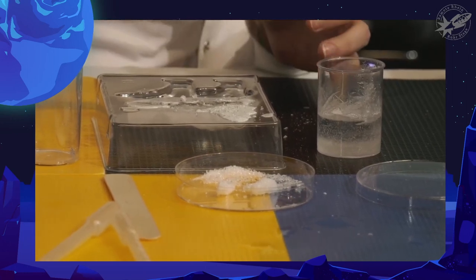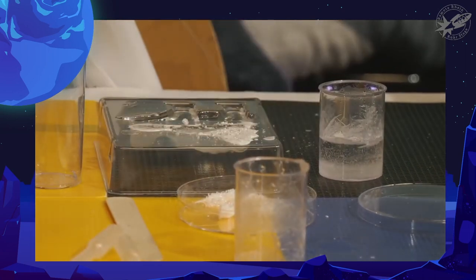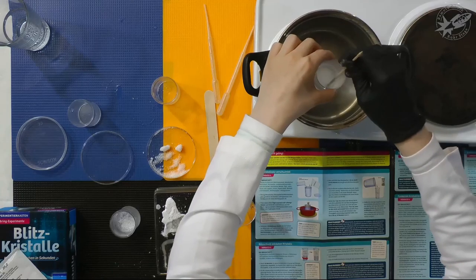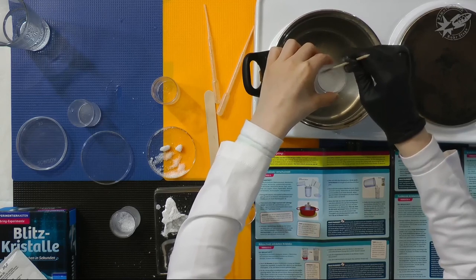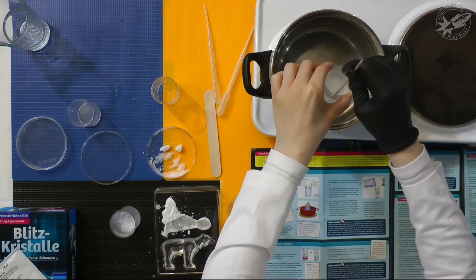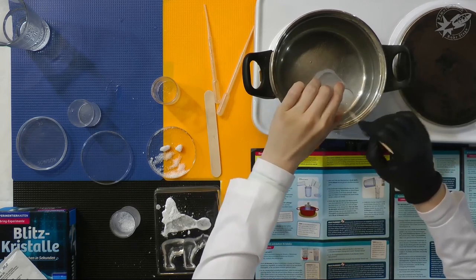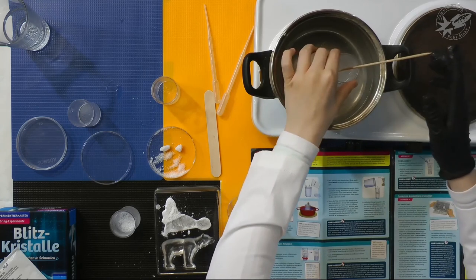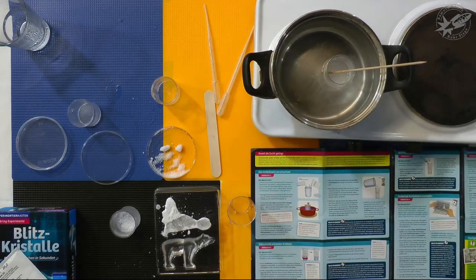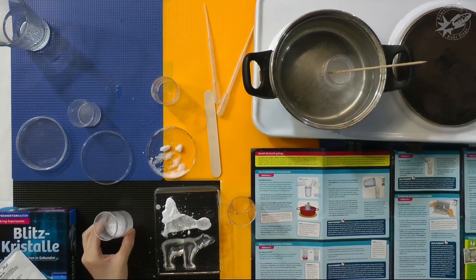I'll pour this liquid into here, into the form. It should cool down now. I will check on my solution. Es löst sich langsam. It is slowly dissolving.